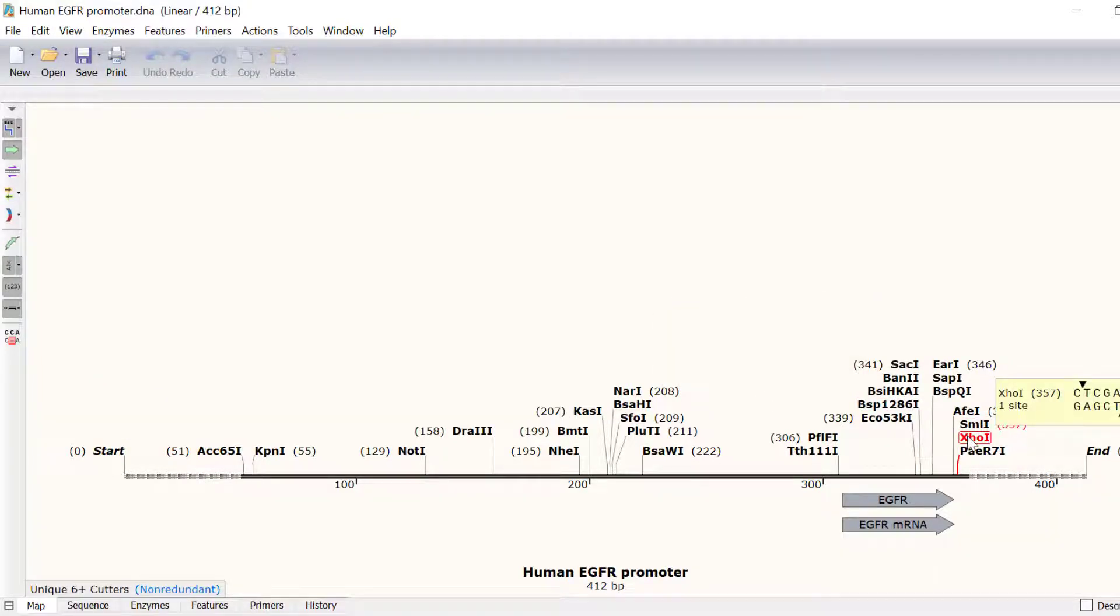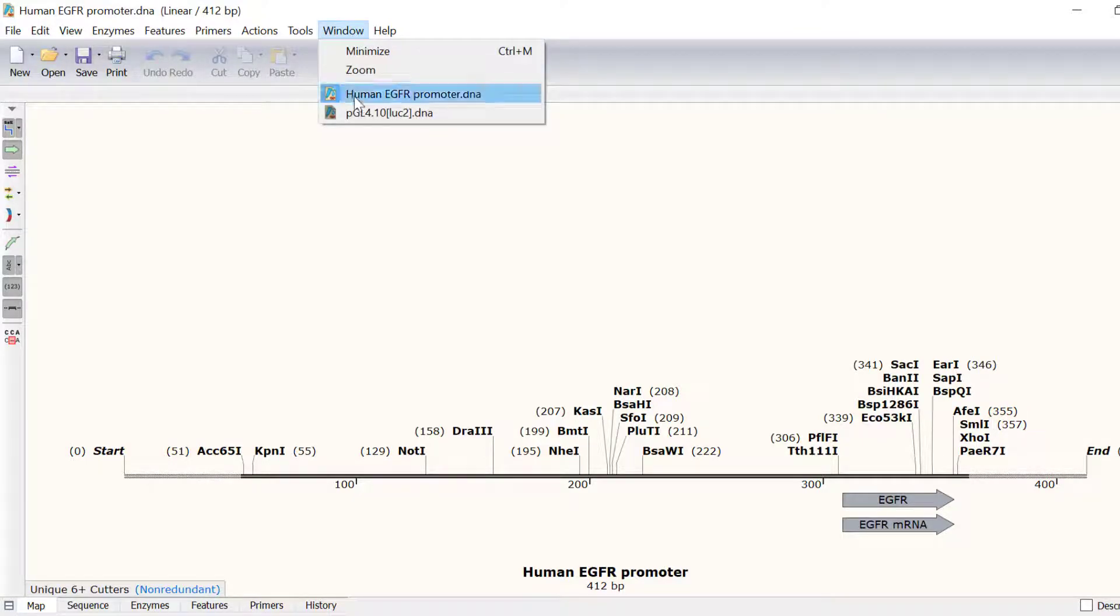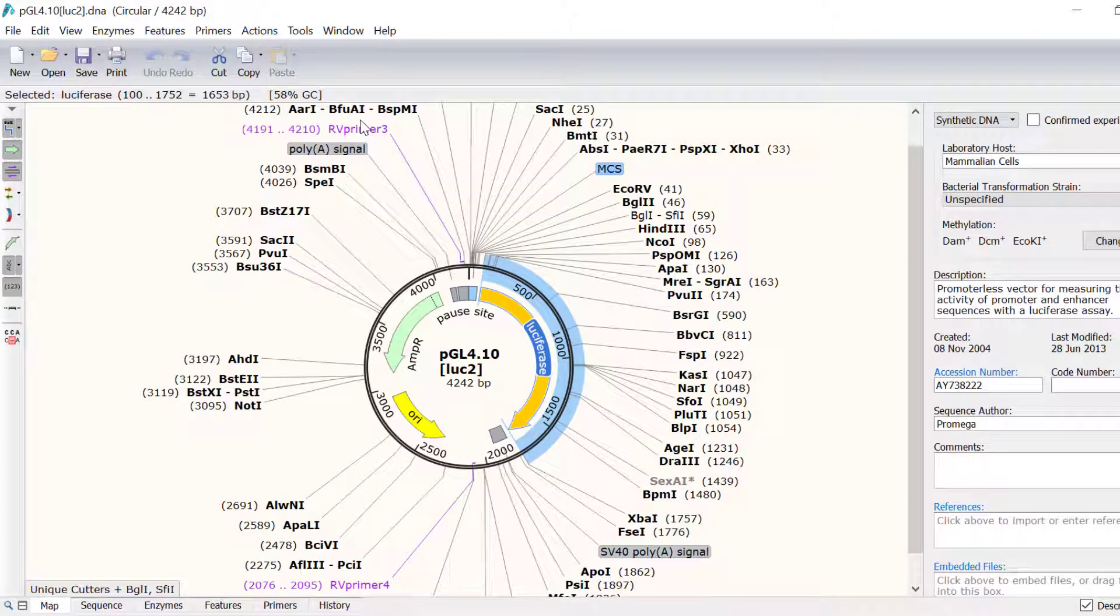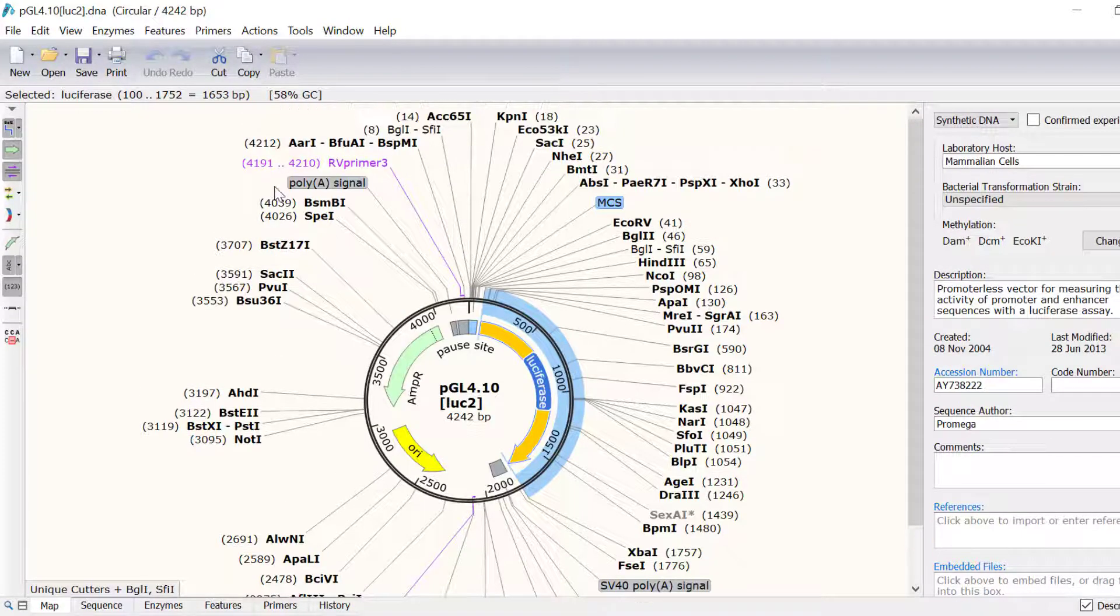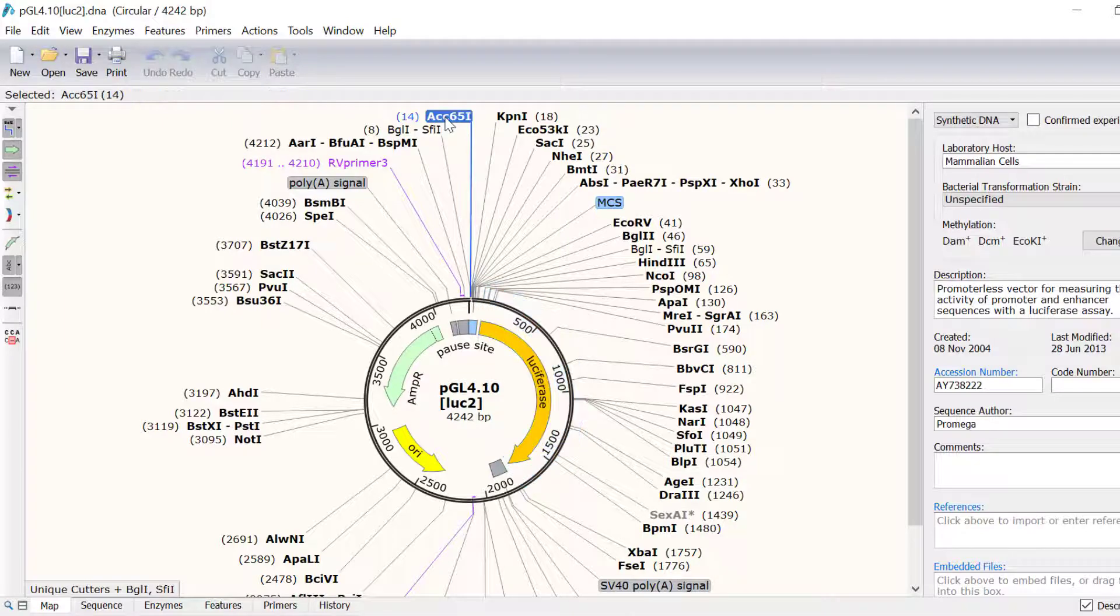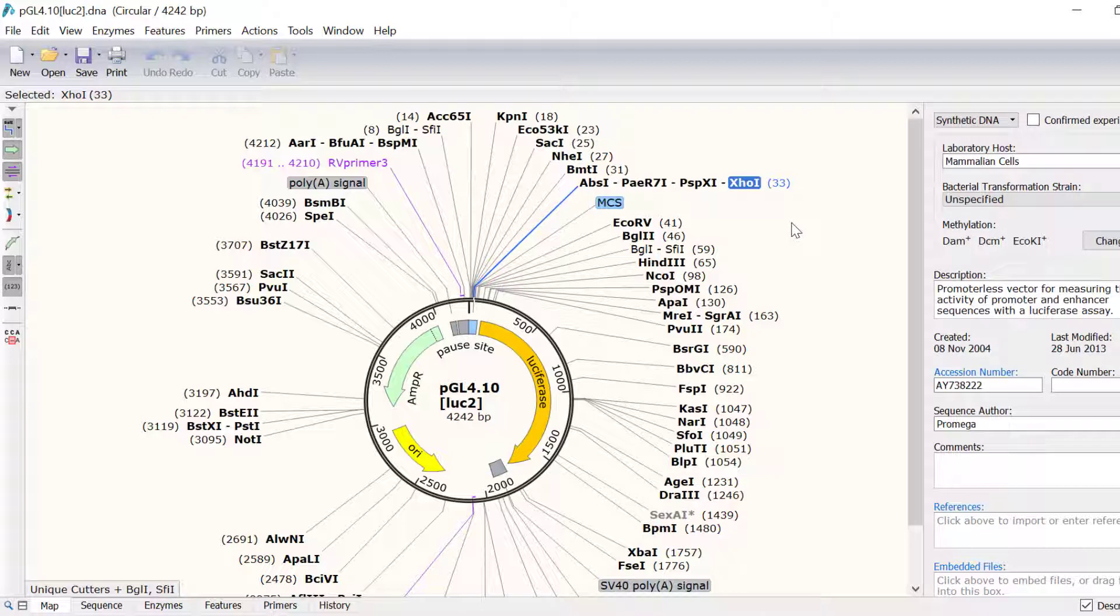So now I'll switch back to the vector file by going to Windows and then selecting PGL4.10 Luc2. As you can see in the map view, there are the same ACC651 and XHO1 restriction enzyme sites inside the multiple cloning site of the PGL4 plasmid.